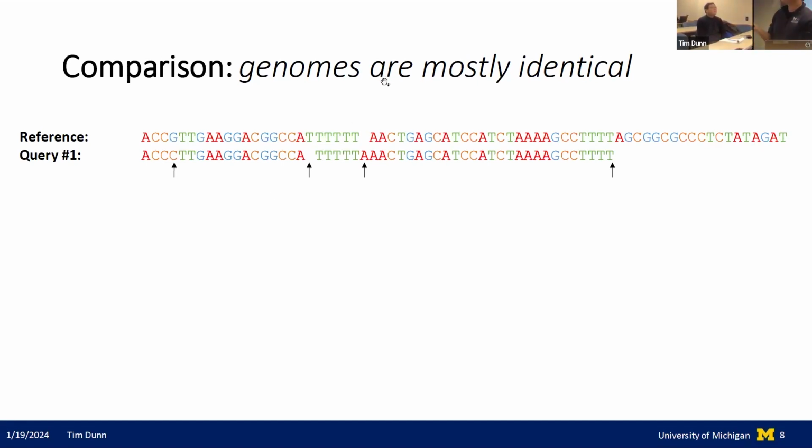So you have the reference human genome along with just the specific locations where there are any mutations, such as a G to C here, a deletion of a T, an insertion of an A, and so forth.